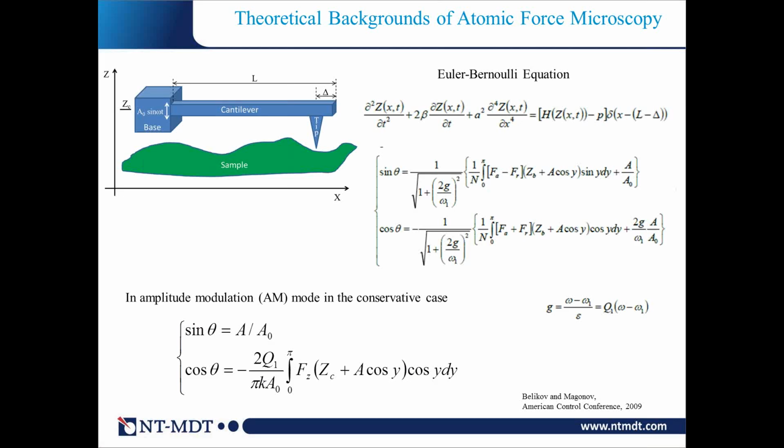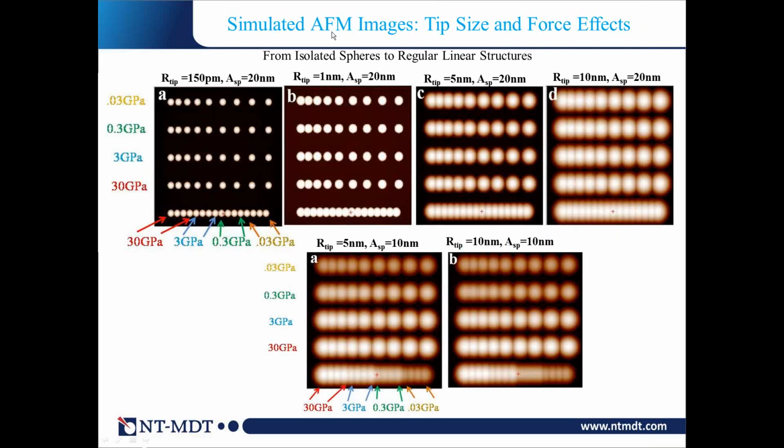is implemented, and many of us probably already have a copy of the simulator based on the solution of this equation, which in principle can give you the means for modeling the images and the force curve in atomic force microscopy. This is one of the results obtained with this simulator, which shows a very simple thing.